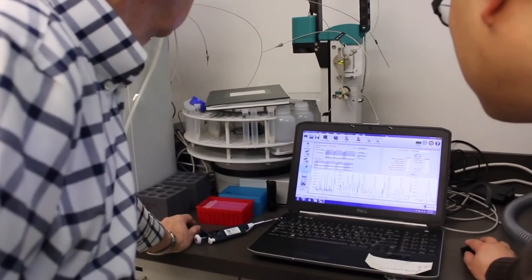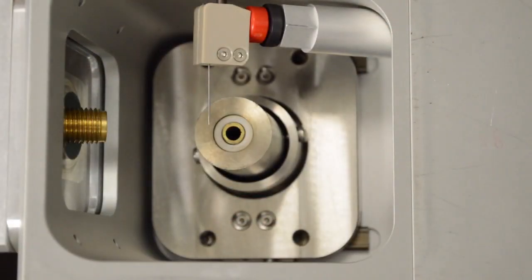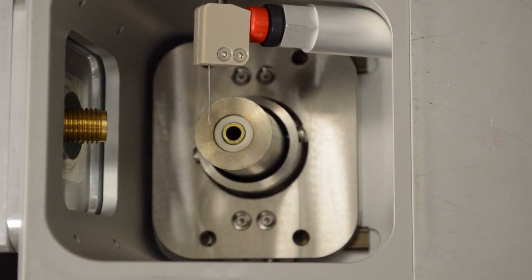Heated nitrogen in the ASAP-enabled APCI ion source will vaporize your sample, or the corona discharge needle will ionize it.